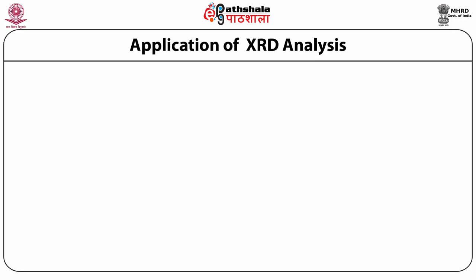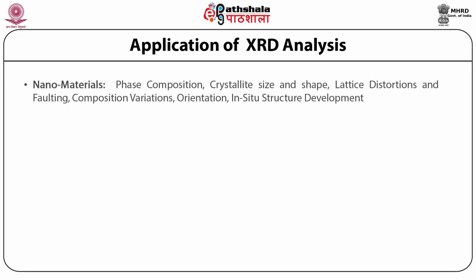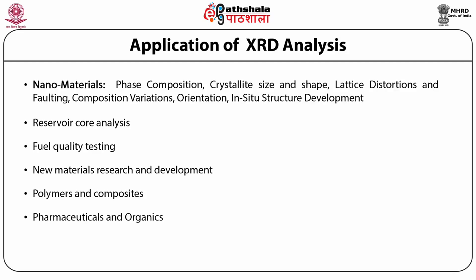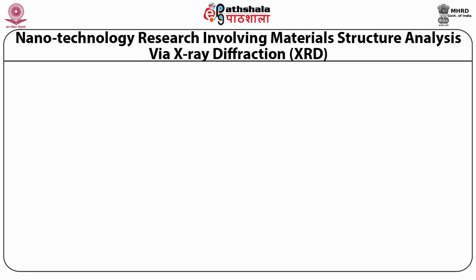Main application of X-ray diffraction analysis includes the nanomaterial. We look for phase composition, crystallite size and shape. We look for lattice distortions and faulting. We test compositional variations, orientation, in situ structure development, etc. This technique is also used in reservoir core analysis, fuel quality testing, new material research and development, polymers and composites, pharmaceuticals and organics, polymorphs, crystallinity, and orientation. We will discuss one of the applications, that is nanotechnological research involving material structure analysis via X-ray diffraction.